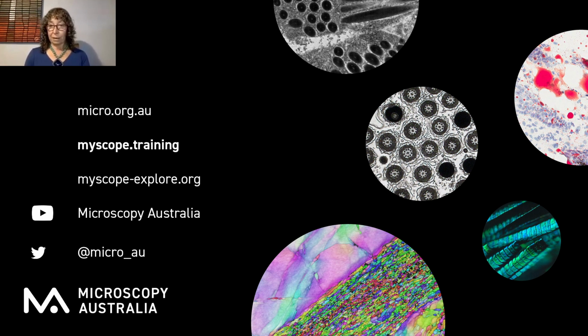Okay, are you planning to make a MyScope Explore for light microscopy? Not at this stage. We would need to specifically have funding to do that. We were very lucky to have a partnership with FEI, as it was at the time, now Thermo Fisher, who supported the development of MyScope Explore. If we were able to secure such a partnership and interest, that is something that we could potentially explore, but there are no immediate plans for that.